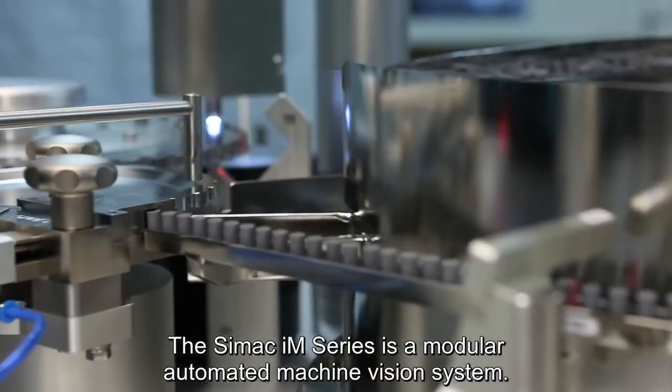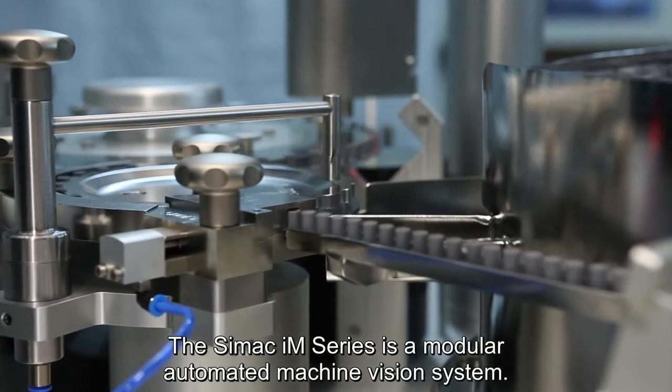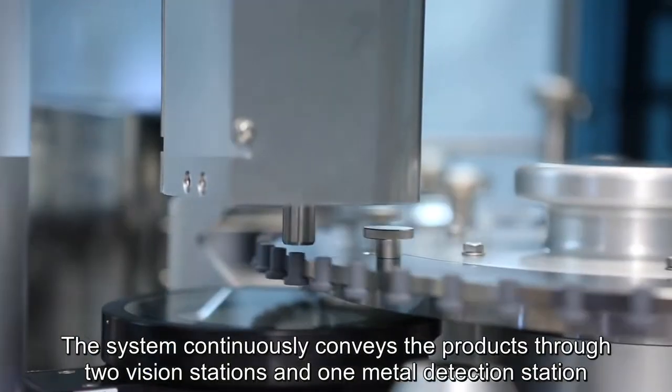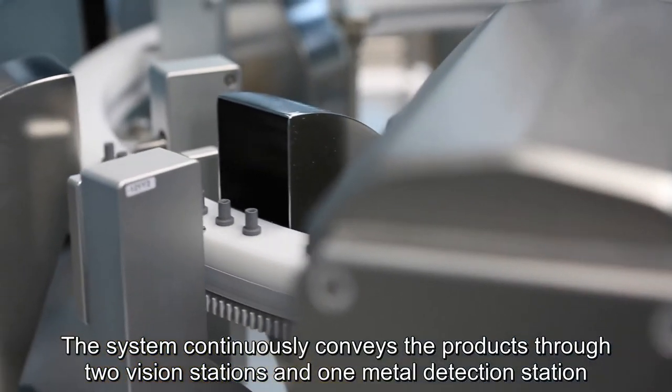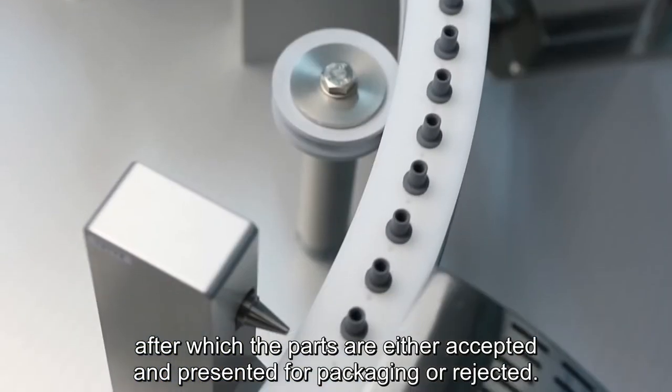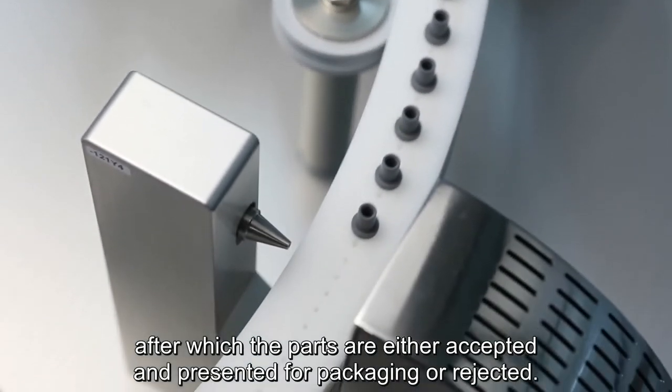The Simac iM Series is a modular automated machine vision system. The system continuously conveys products through two vision stations and one metal detection station, after which parts are either accepted and presented for packaging or rejected.